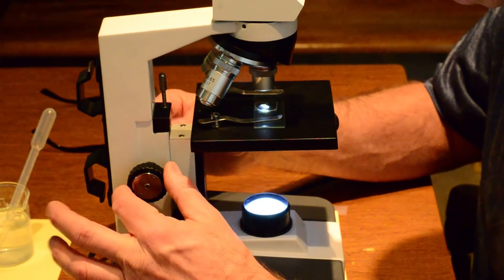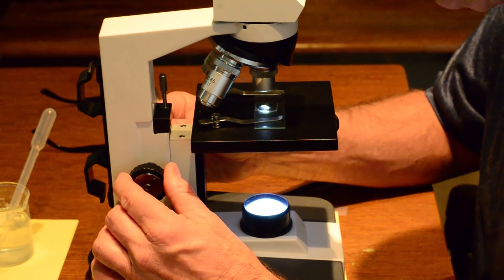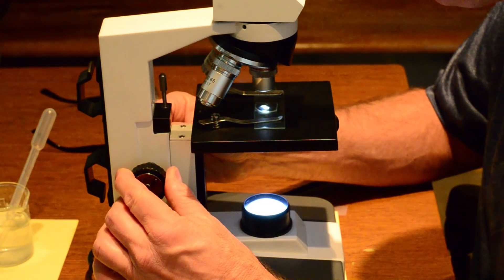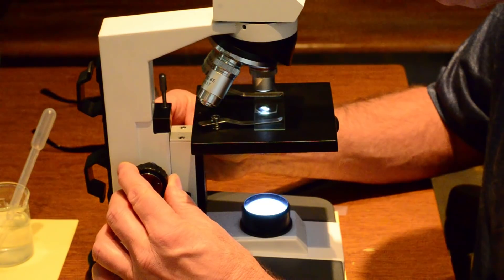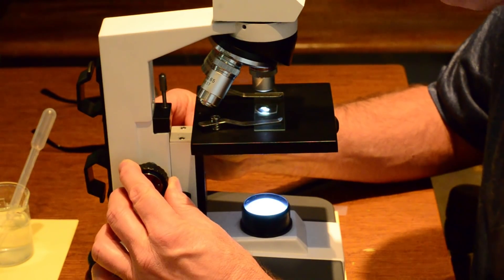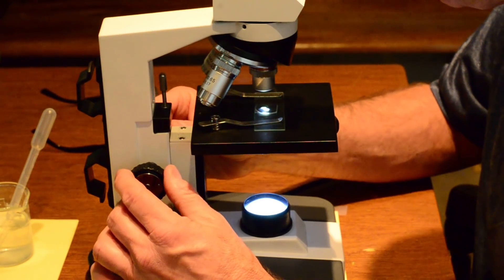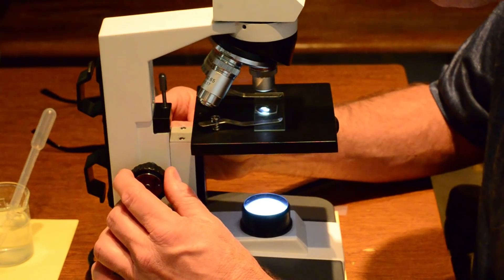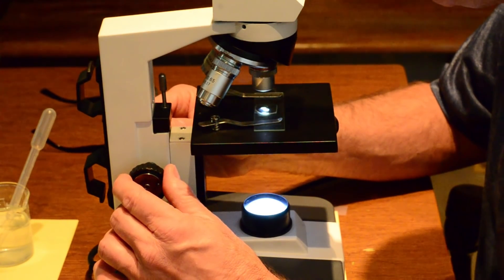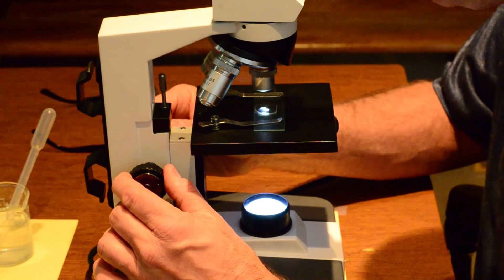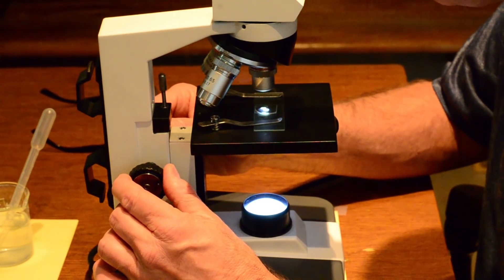And I'll grab my coarse adjustment knob and move it down until it comes into focus. I'm going to go real slow and voila. Beautiful. Now I'm looking at a very interesting arrangement of cells. I see the outer portion of the stem and some little hair like things that are coming off it. You're going to really enjoy looking at these.